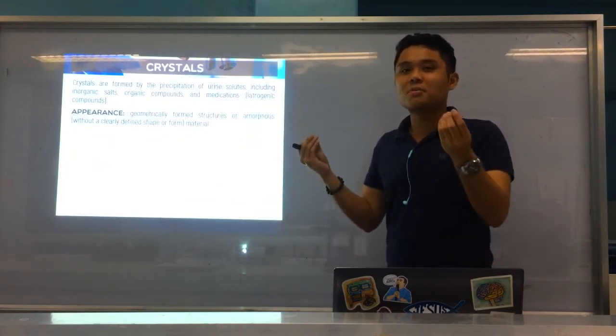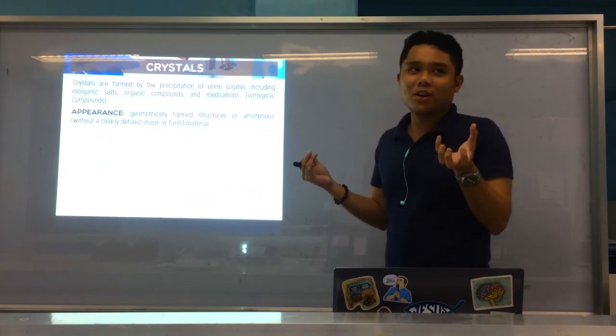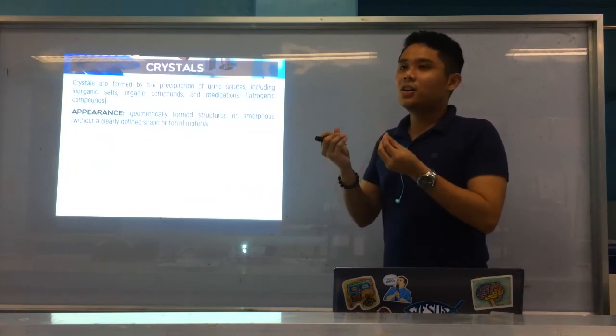Okay? Alright. Amorphous. They look like pulverized powder or something, or what they call this, grains of sand.